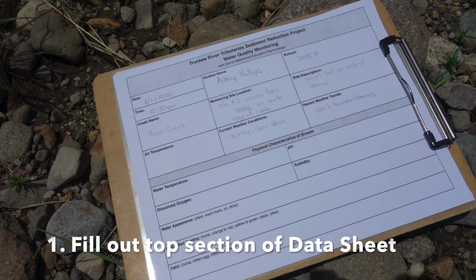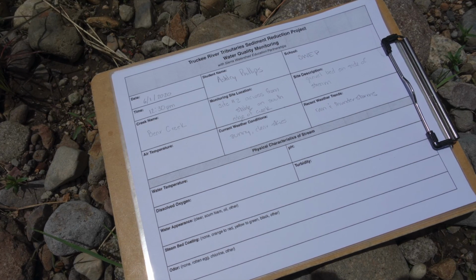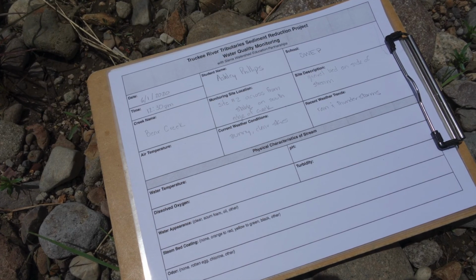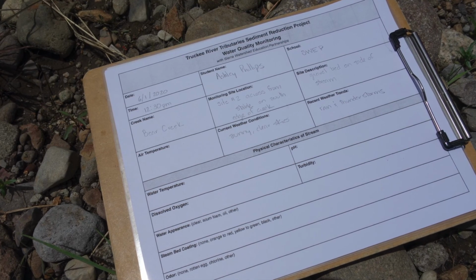Step 1, fill out the top of the data sheet. So you want to make sure you get important elements like the site description. What part of the creek are you on? Is that a wide open gravelly section, or is it the side of an eroding bank, or is it really a narrow part with rapid water movement?